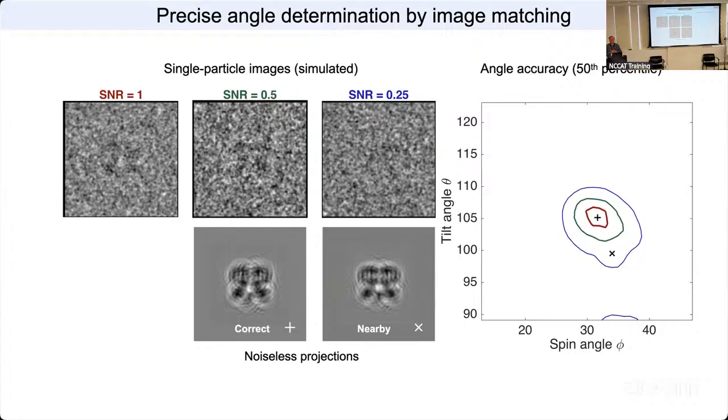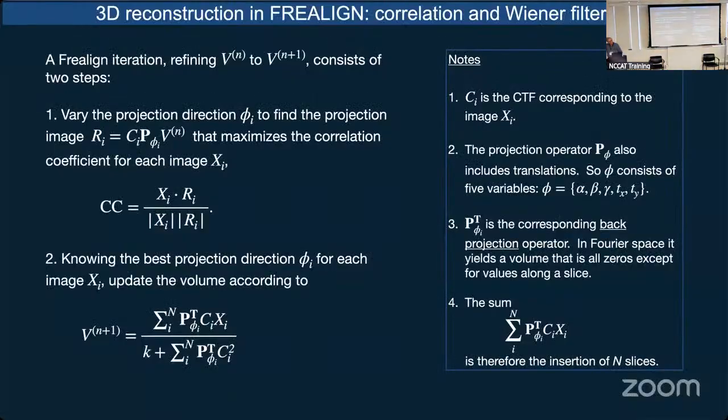Which there was nothing they had beforehand, so you just start with the blob basically. Yeah. Well, they actually started with a random conical tilt image, but nowadays we can get by without that.